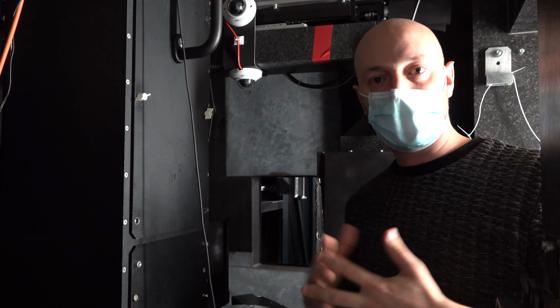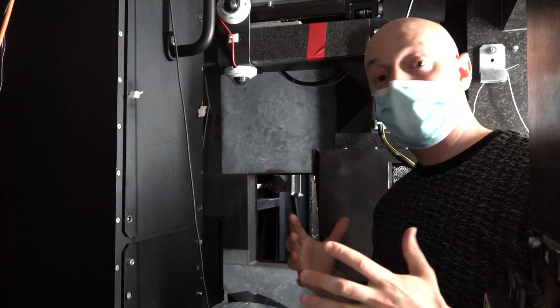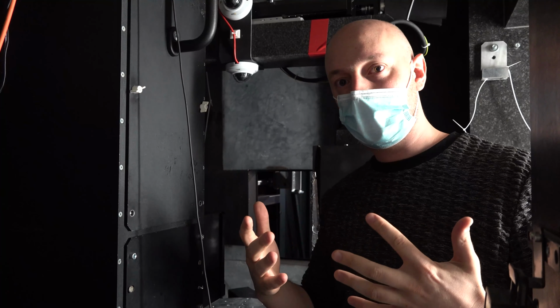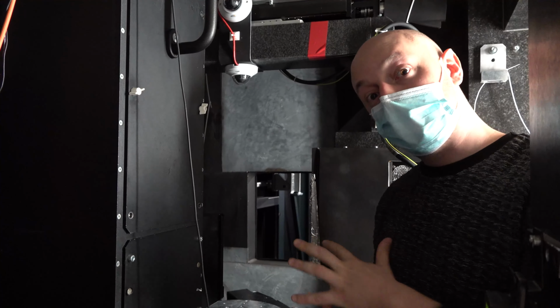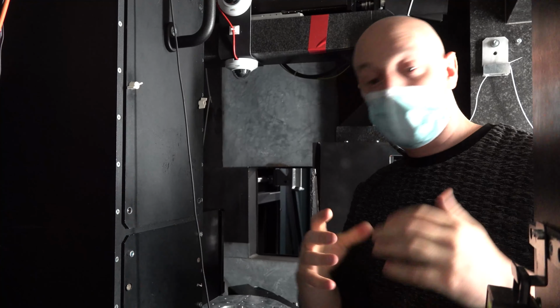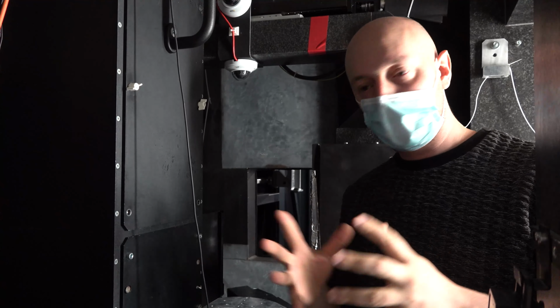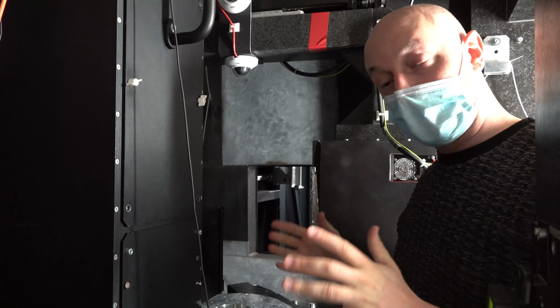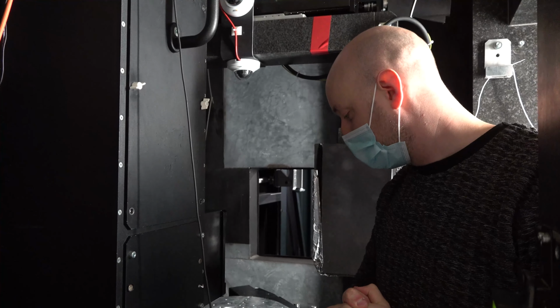Let's take an example of a battery then. If we do a cycling, we will be able with the neutrons to see where the lithium goes as we charge and discharge the battery, and the X-rays will provide information about the intercalation within the electrodes and any damage that develops within the battery itself. So that's it. These are just a couple of very nice examples that can be done.